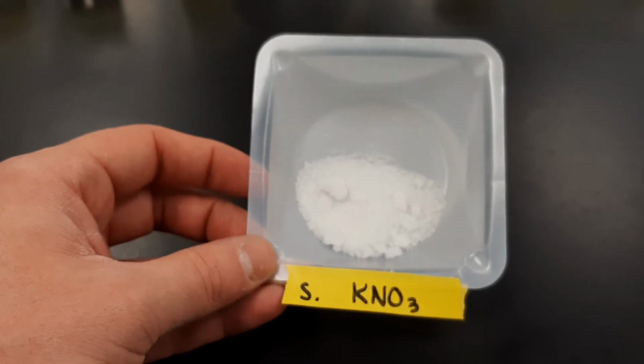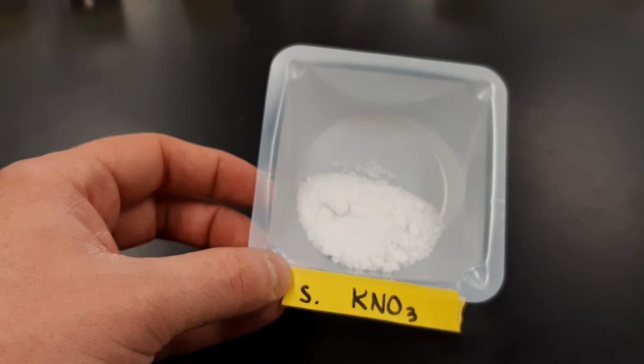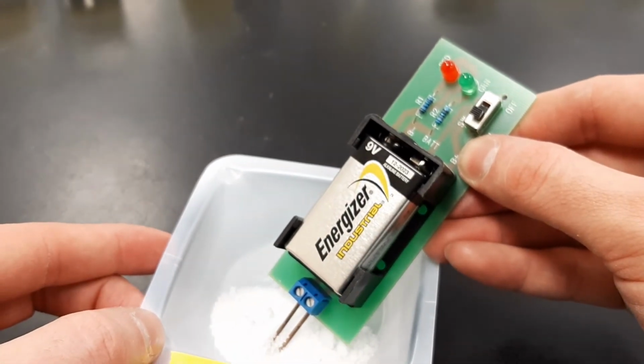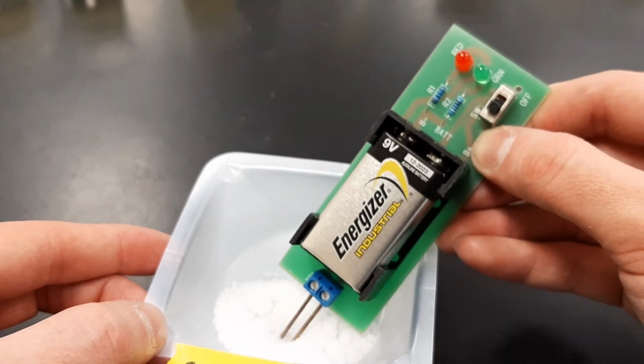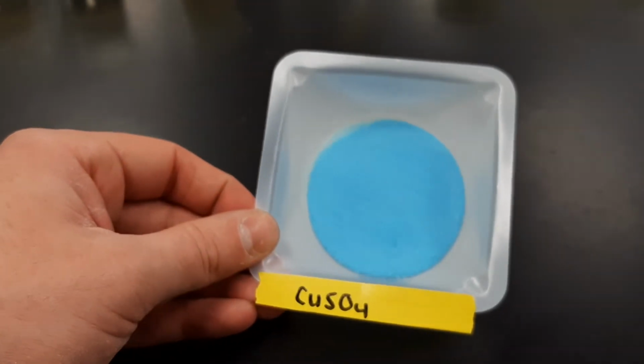After the rubber tubing, we can look at solid potassium nitrate. This has a formula of KNO3, and the fact that it's a solid is indicated by this lowercase s. Okay, so this is inside of that powdered solid KNO3. Is this an insulator or a conductor? Next will be copper sulfate, which has a formula of CuSO4.